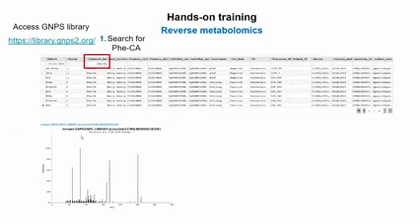As Vincent was pointing out, you need to go to page 2 and click the last one. And then click on the circle.